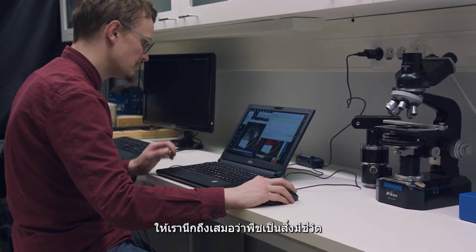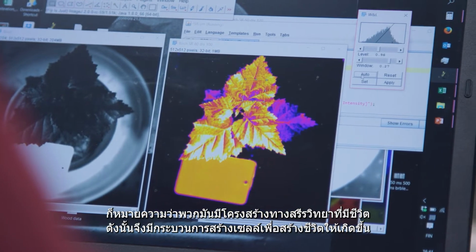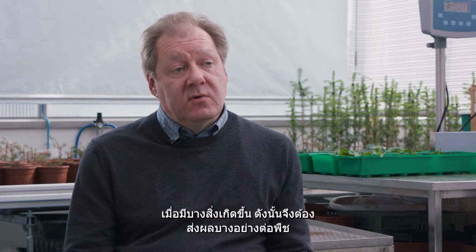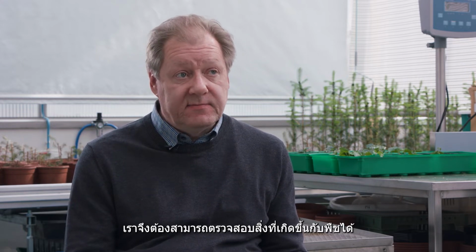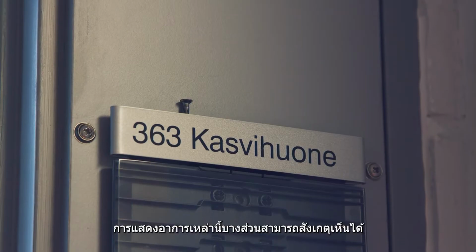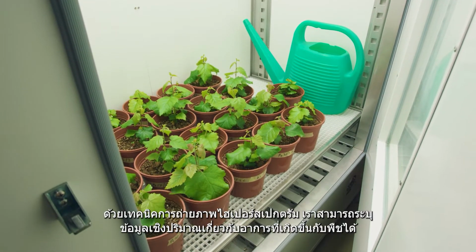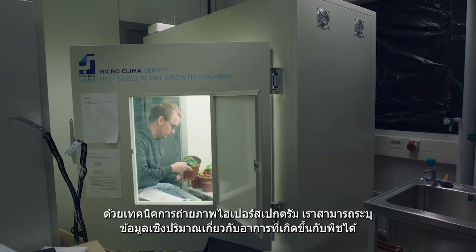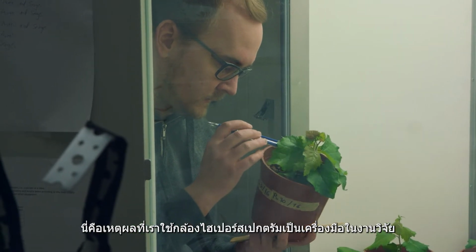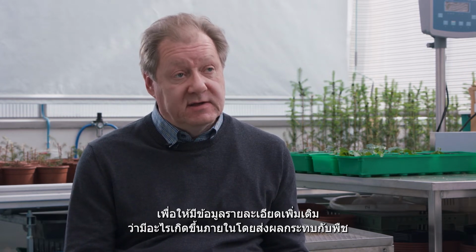If we think of plants as living organisms, it means that they live, they have physiology, so all the cellular processes that make life. So when anything happens, it has some consequences for the plants, we have to be able to monitor what is happening with the plant. And some of these symptoms are then visible. We can monitor them just by looking at them, and we can see that now there's something wrong with the plant. But with hyperspectral imaging, we can get quantitative information about the symptoms. And this is why we are using it as a research instrument, to have more detailed information of what is going on there inside the plant.